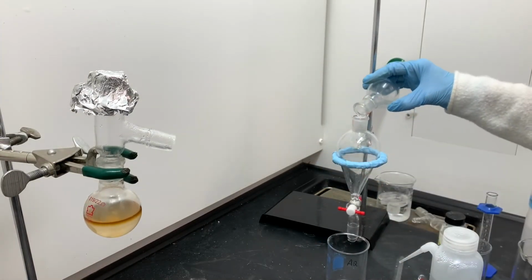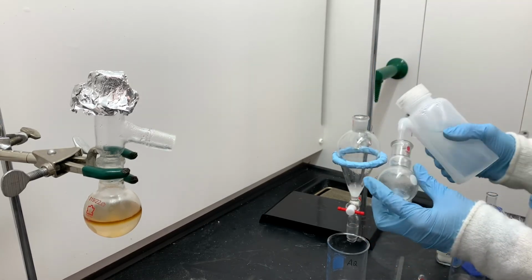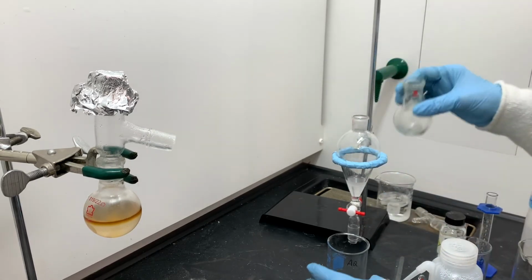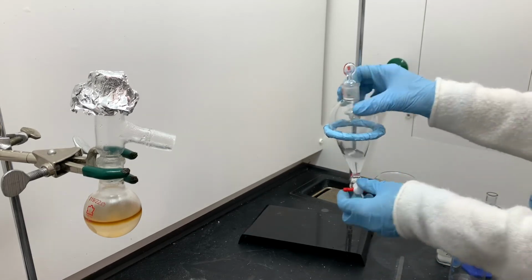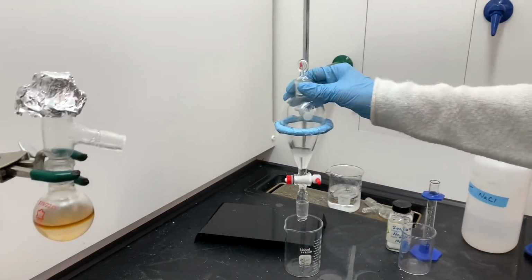And I'm going to begin by using some deionized water to rinse out the inside of the round bottom flask. Remember, the byproduct of the reaction is water, so it's safe to add water. There's probably already some water to begin with. The water is heavier than the product, so the product is on the top layer inside the separatory funnel. The water is down on the bottom. The water is nice and clear. The product is kind of hazy.